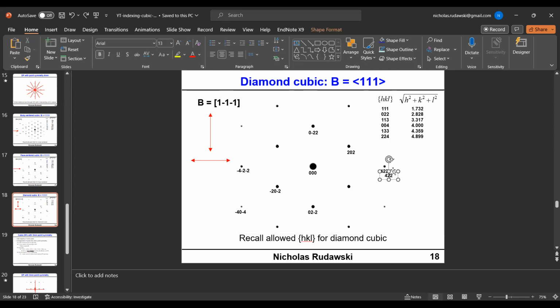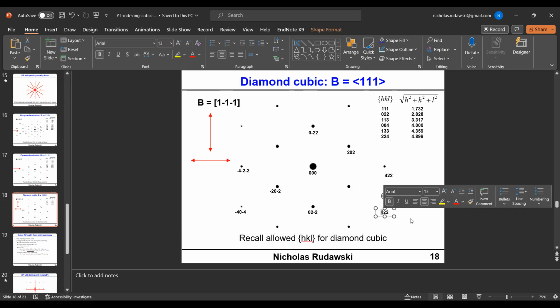This is 4, 2, 0. Does that make sense? No, that shouldn't be right. 4, no, 4, 4, 0.